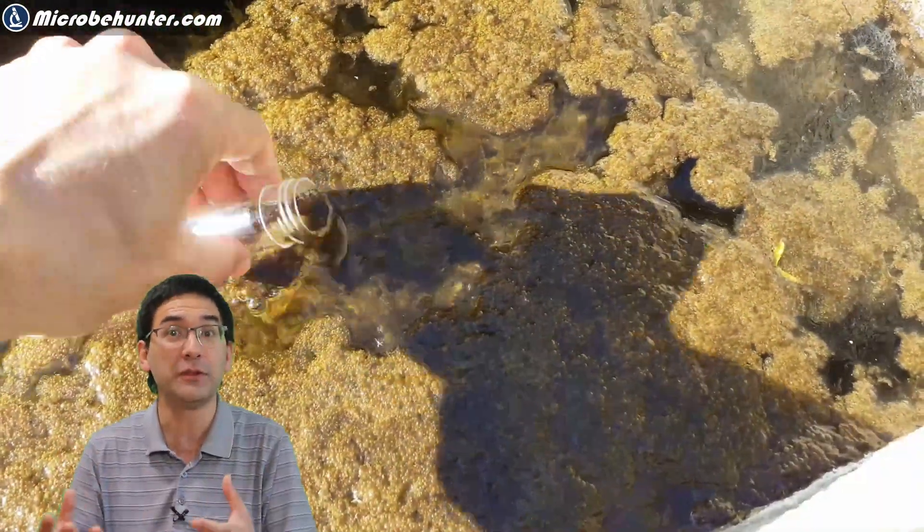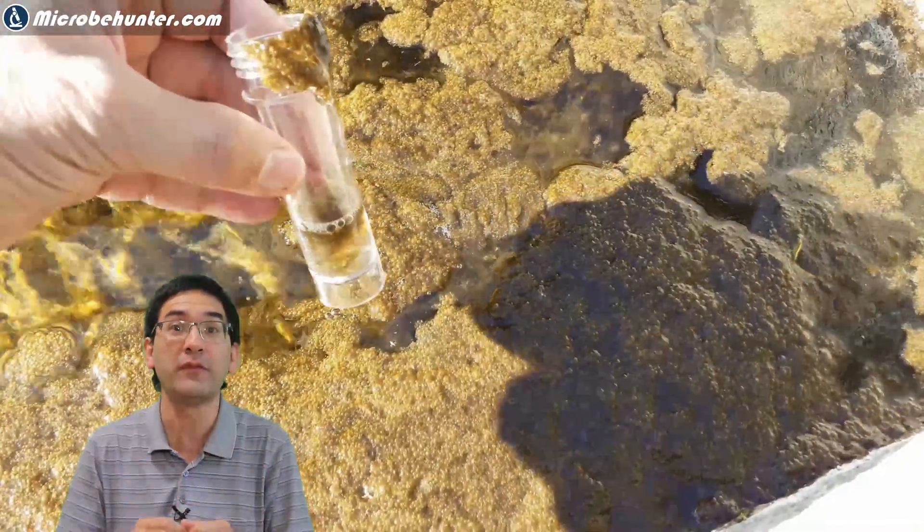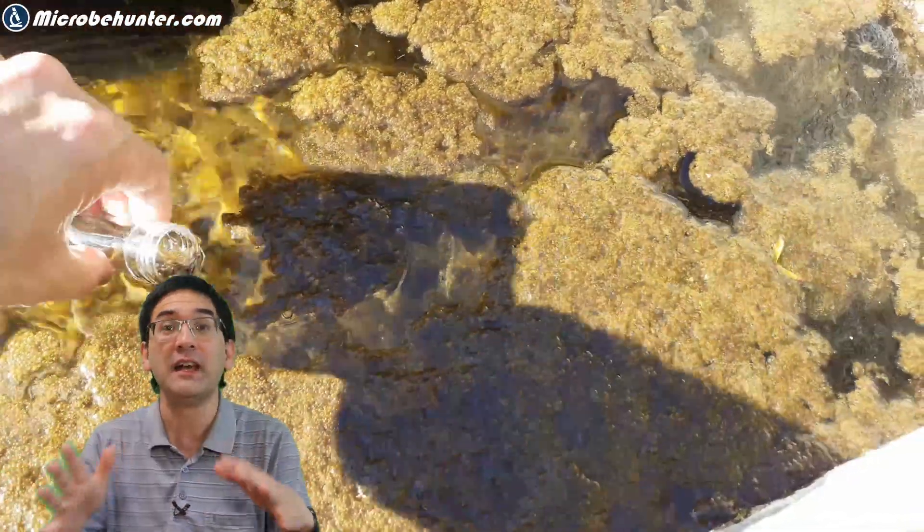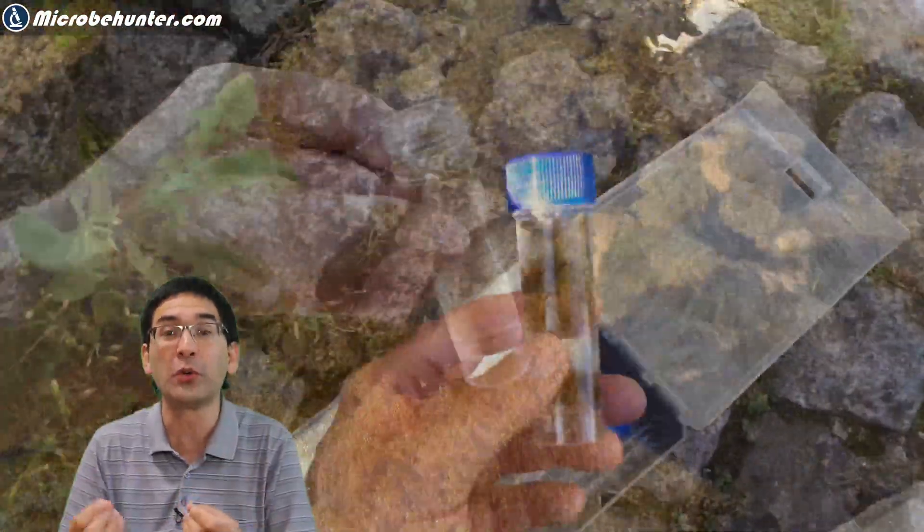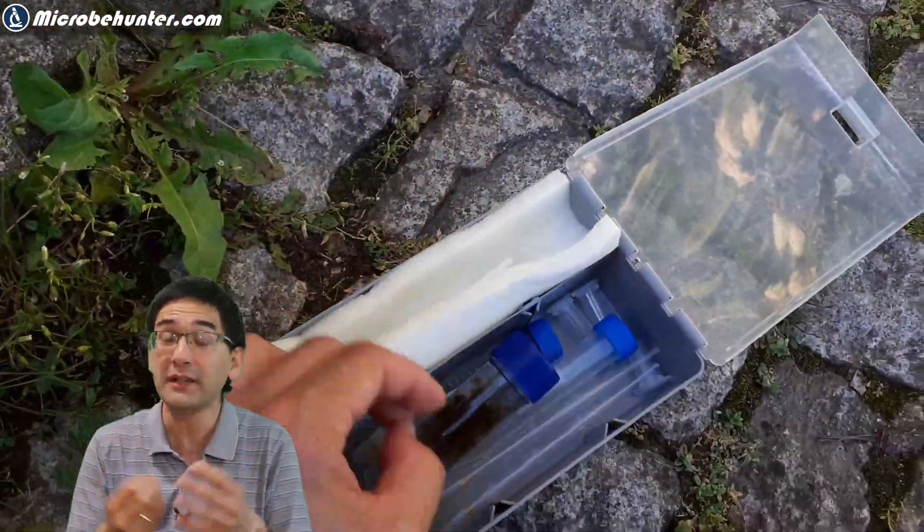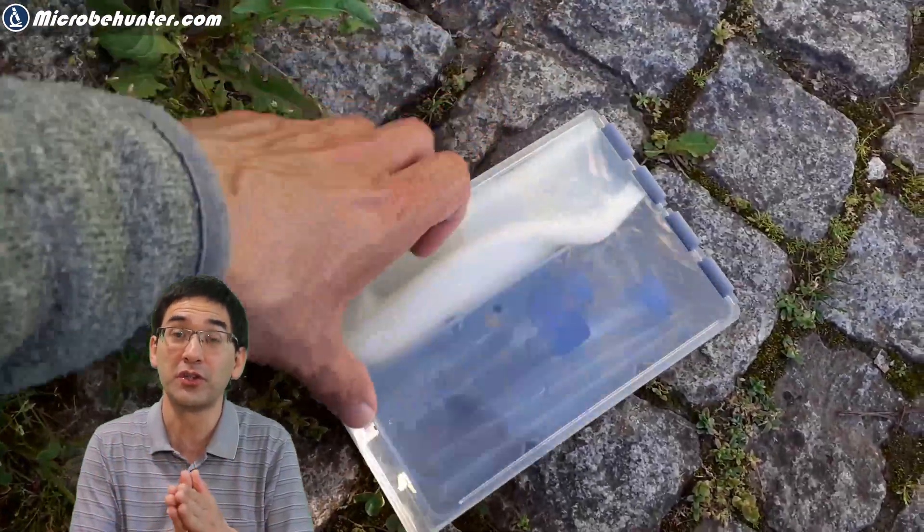If you want to collect microbes, I highly recommend that you collect not the water itself but rather the solid material that you find growing on the water surface and also on the side of the water fountain, because many microorganisms like to be connected to a solid surface.